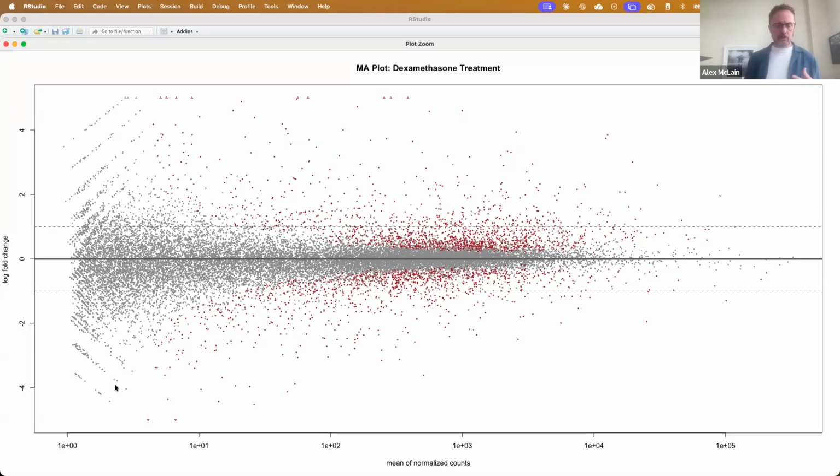The p-values that we look at take this into account. So notice that where the gray points are for means that are down on this end is a lot wider than where they are up on this end. Up here, red points occur for very small log2 fold change, like around 1/2. You're already significant. Down here, when the mean is lower, even when you're out past -4 or +4, sometimes we still don't have significance.